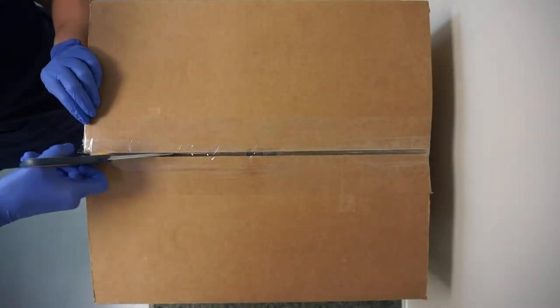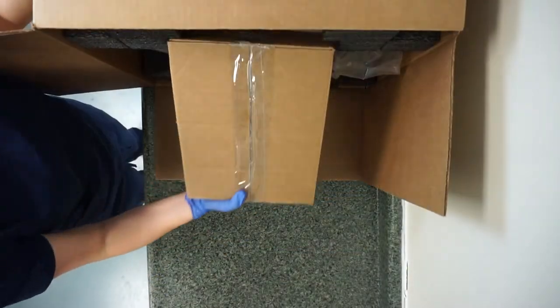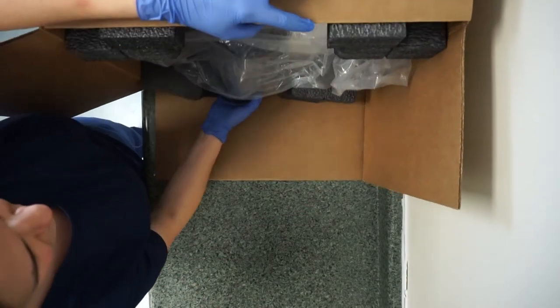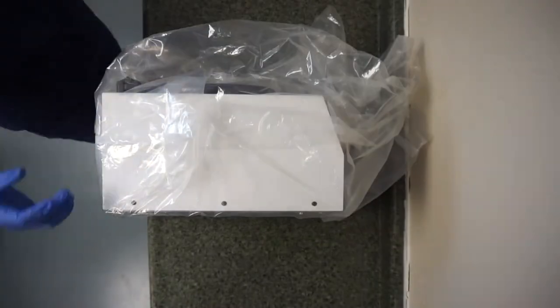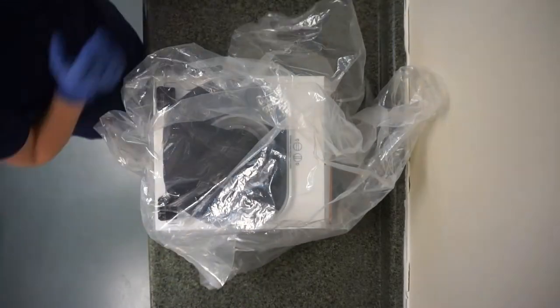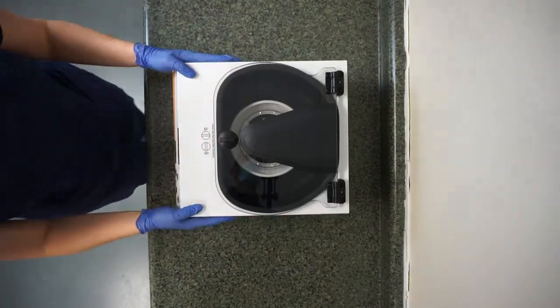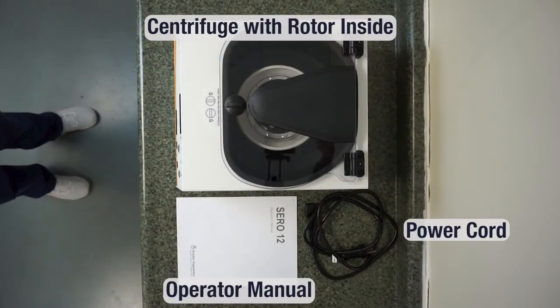Part 1, Unboxing. Your centrifuge arrives securely packaged from Drucker's manufacturing facility. Pay attention to this accessories box — this holds all the accessories that you'll need to get your SERO 12 running. Once you've got your centrifuge and your accessories box unpacked, this is everything that you should have.